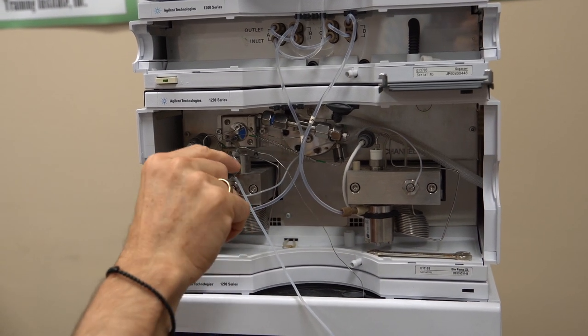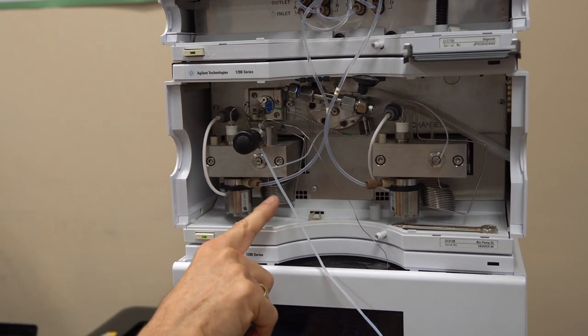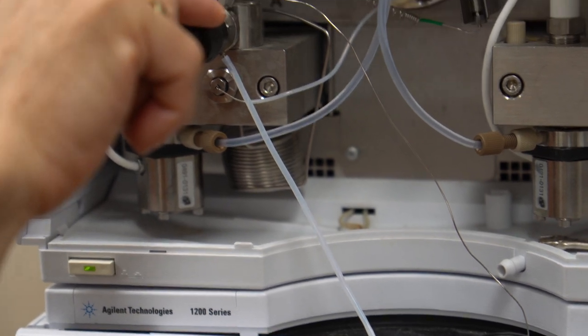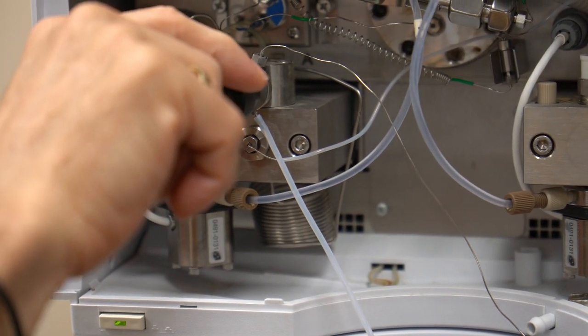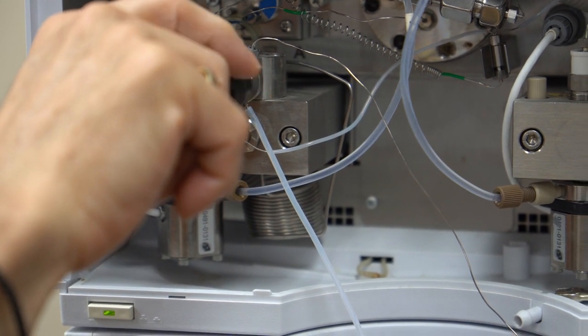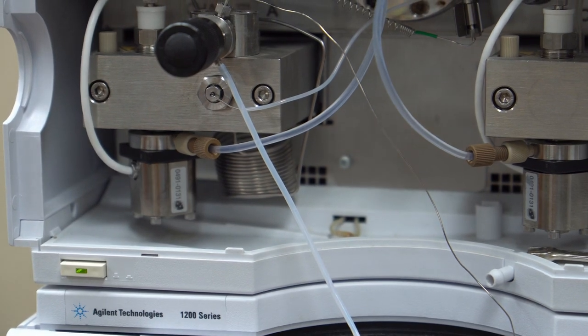This is my own little trick. I like to start turning in the needle valve. You probably see these little air bubbles coming out. The way I think of it is, this is a needle valve, which means there was a big air bubble in there. I got rid of 99% of it, but that little bit of an air bubble is still there. I like to, without going all the way in, get close to the end just to flush out that last little bit of air bubble.